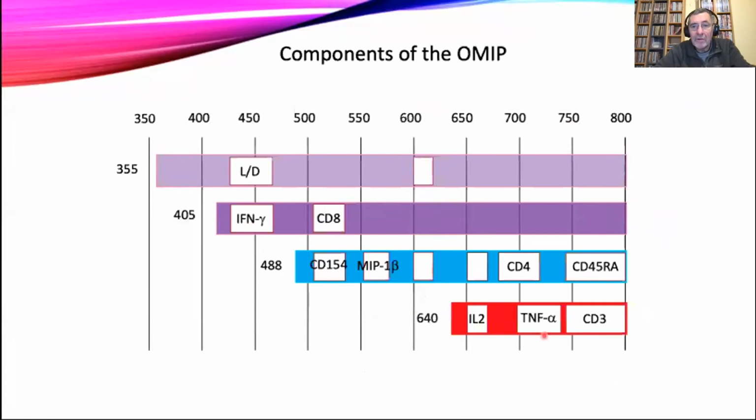Now, 3 of those have been put on the first detection channel in the laser, and as we know, that's the channel that's probably going to get the least interference, so the least number of other photons ending up in that particular channel. But one of those has had to go on here, on Alexa 700, which you might be aware is not a particularly bright fluorochrome.